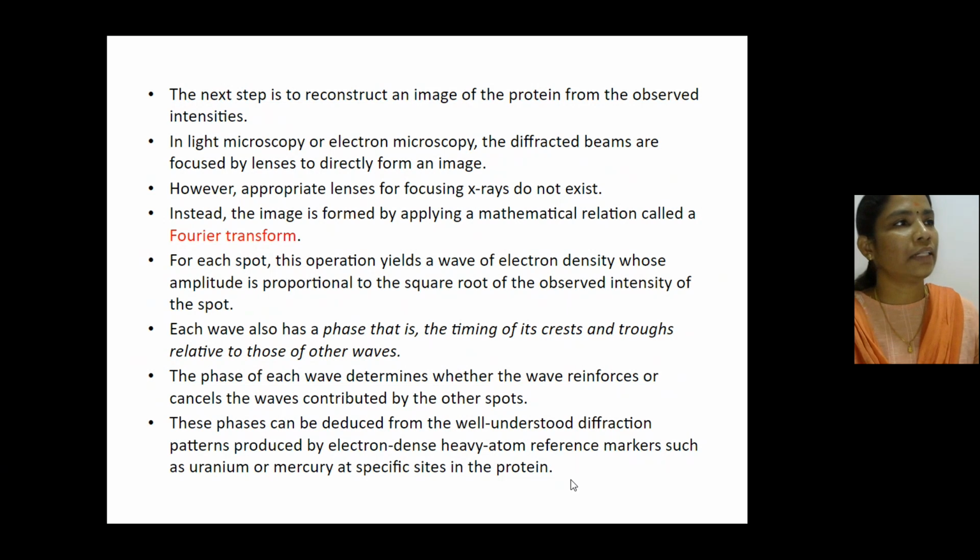We don't know in 3D space which atom is located in which position. Of course we know the sequence of a protein, but what its structure is, is the task we have to solve. Until you know the phase of the waves, or the diffraction pattern, it's not possible to determine.